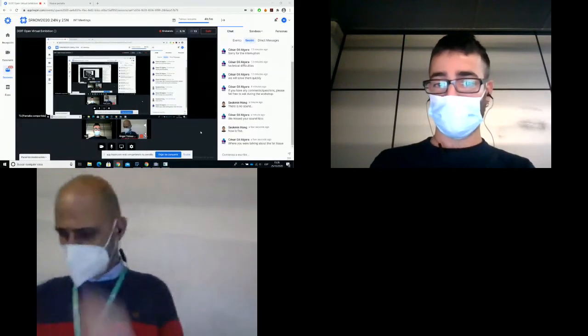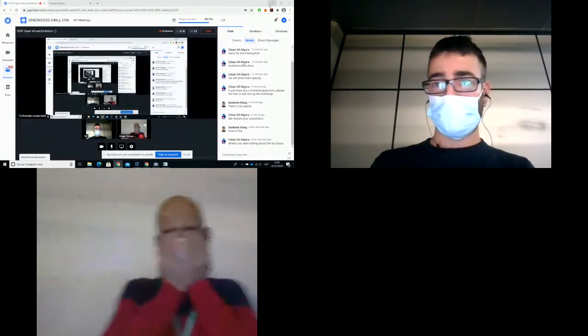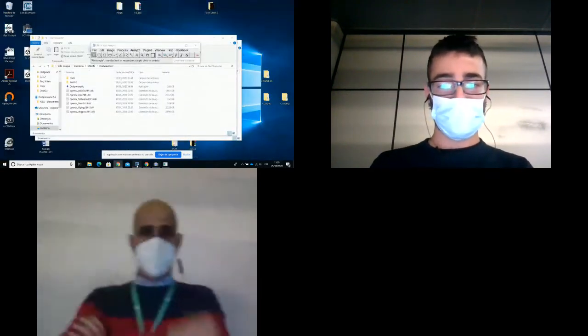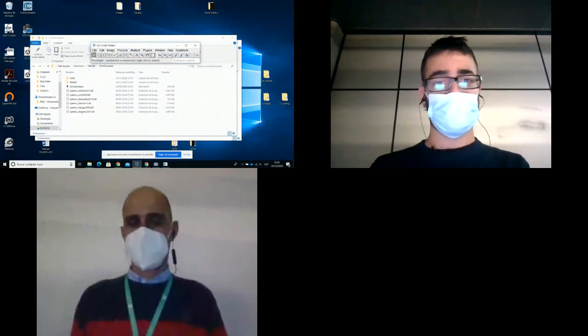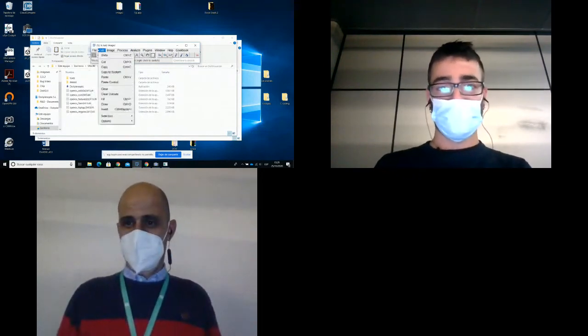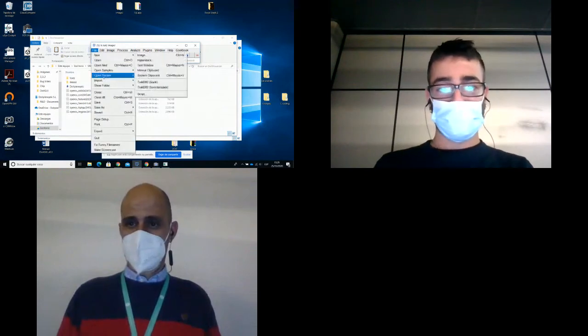We had seen them before, and what I was saying before is that you can use Fiji with the information you saved from our software. You can use your Fiji as always. We saved some images from the fibers, for example.